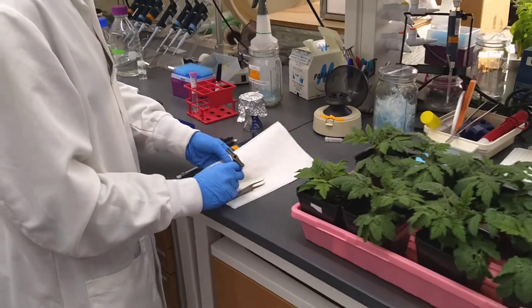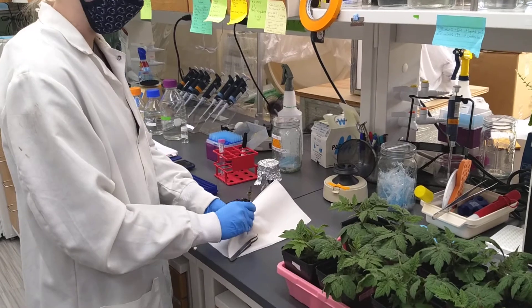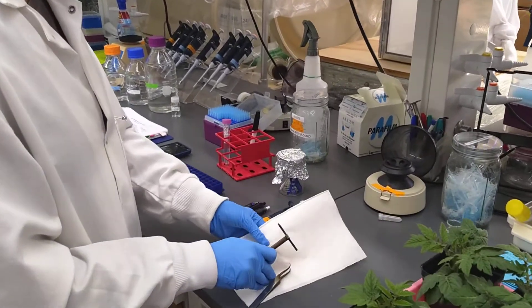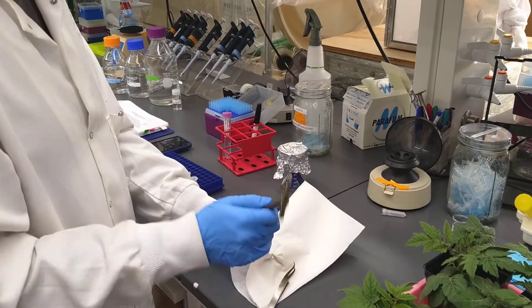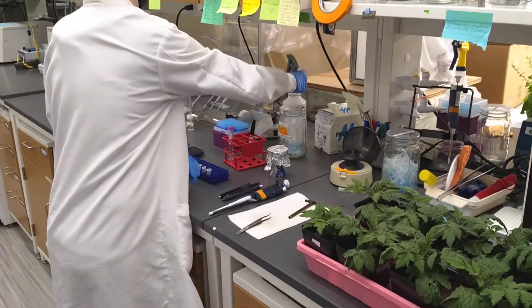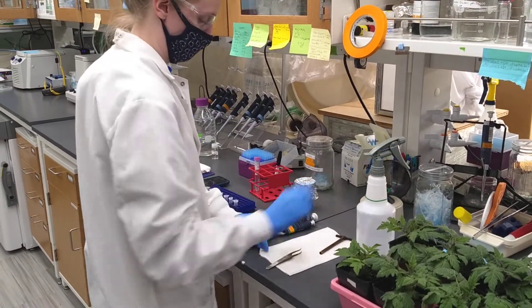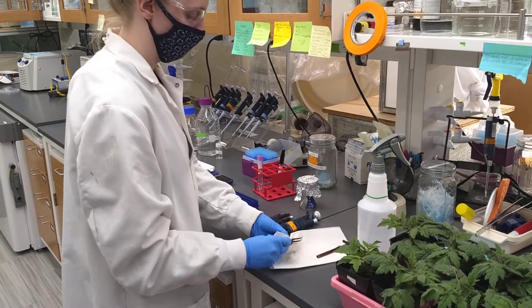First I'm going to sterilize my punch. I've sprayed it with ethanol, and I bunch up the paper towel and actually try to cut the paper towel with the hole punch to make sure that it's fully sterile. We're going to repeat this process between every sample.